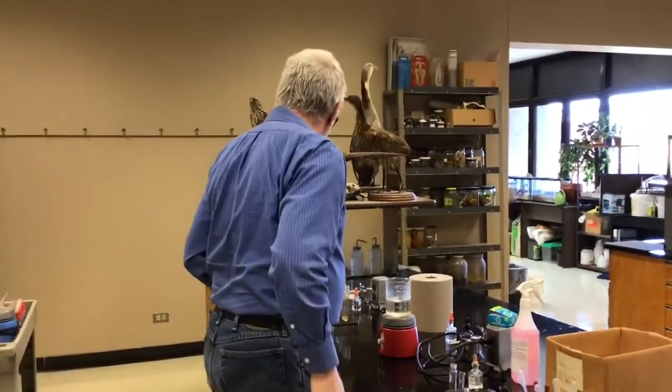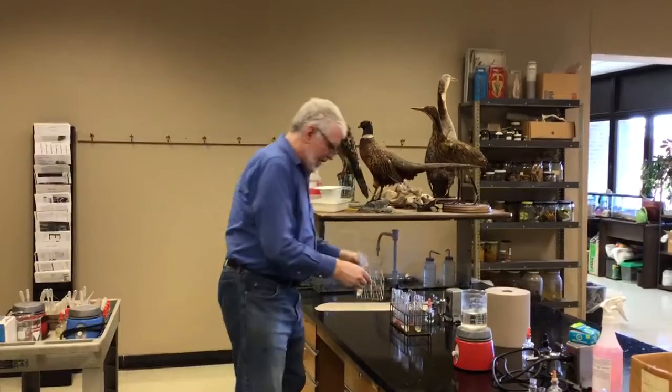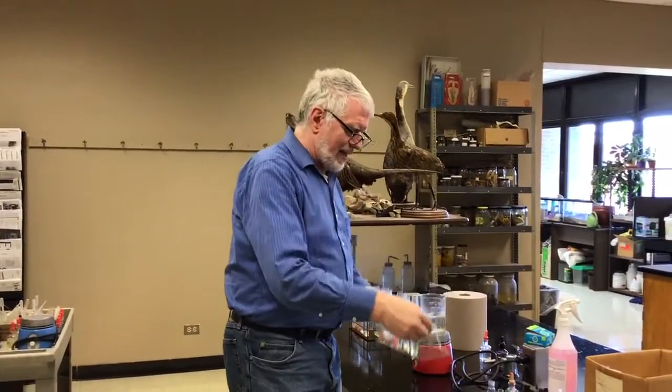How far in are we? 9 minutes and 16 seconds. Okay. We're going to run our Biuret test on these foods.